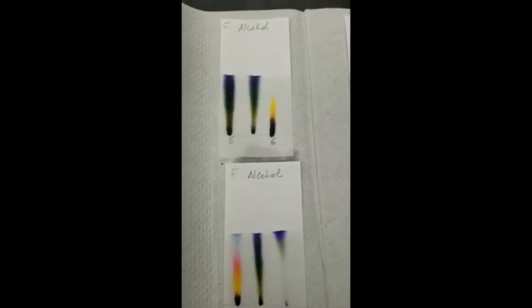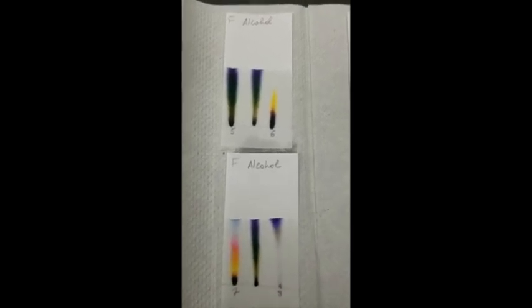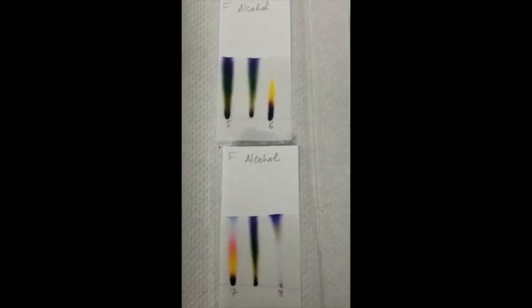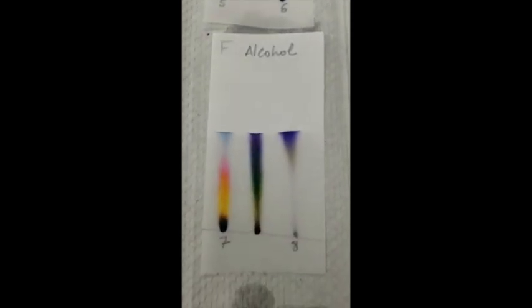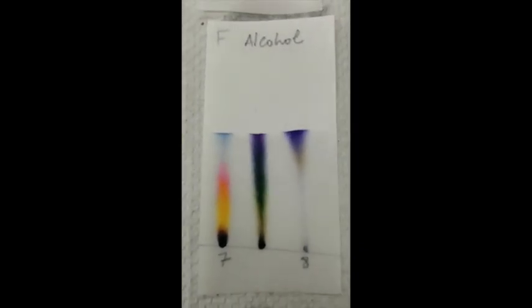After completing this experiment, these are the results you should get for known F. I will zoom in on each of the papers so that you can observe the patterns and see how the chromatogram worked for each of the solvents that you made.